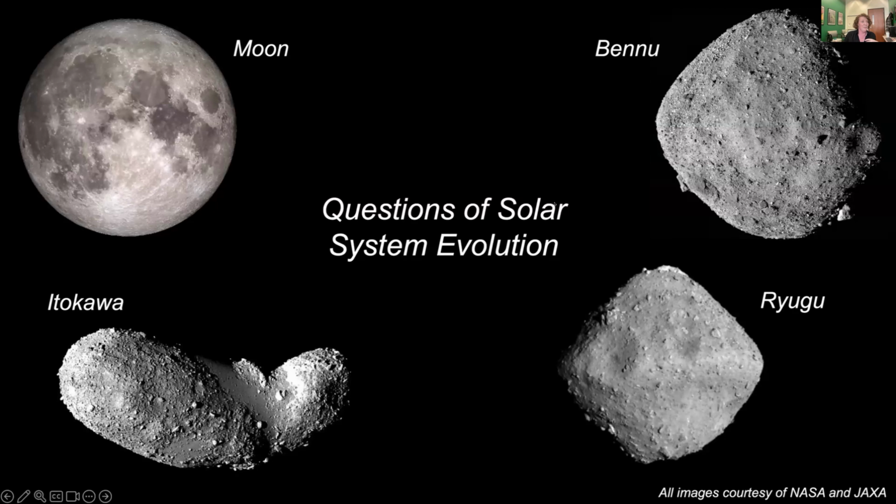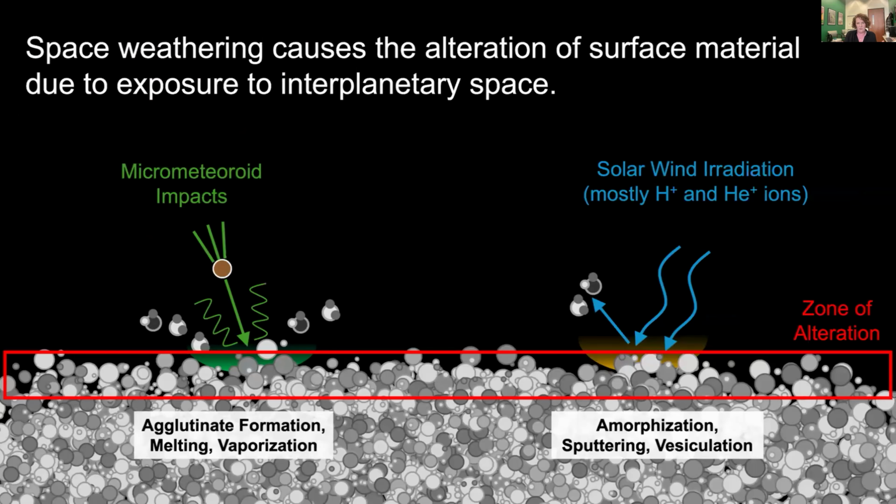Now, many of you, or most of you, better be familiar with the moon. We brought back samples from the moon through the astronauts on the Apollo program in the 1960s and 70s, but you may be less familiar with other sample return collections that we have, including samples from asteroid Itokawa, and then samples that were recently returned from asteroids Ryugu and Bennu. So I'm interested in studying these materials using electron microscopy techniques to try and understand how they've evolved over the last 4.5 billion years. And one process that I'm particularly interested in studying is something called space weathering.